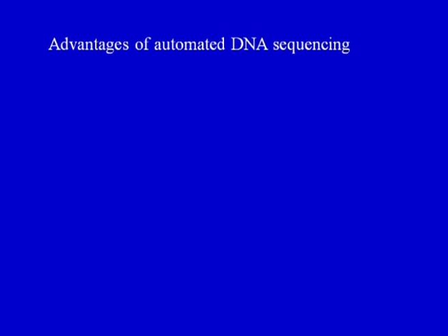There are a lot of advantages of the automated DNA sequencing method. One is that manual sequencing can generate excellent data, but even in the best laboratories, poor autoradiographs are frequently encountered, and that will make sequence readout difficult or impossible. Usually the problem is related to the need to run different termination reactions in different tracks of the gels.